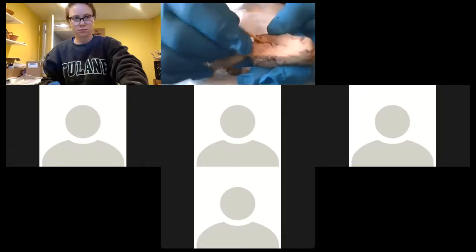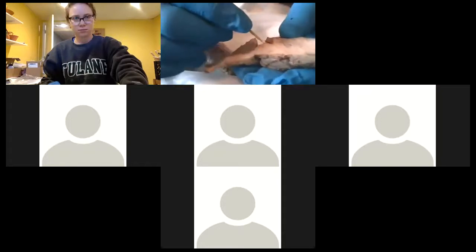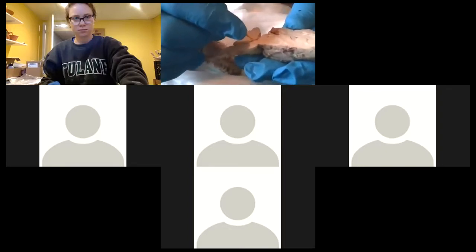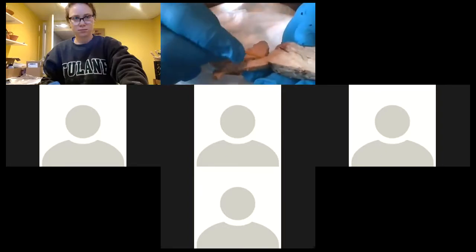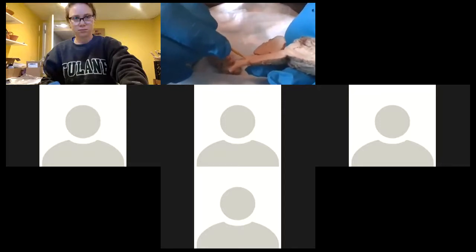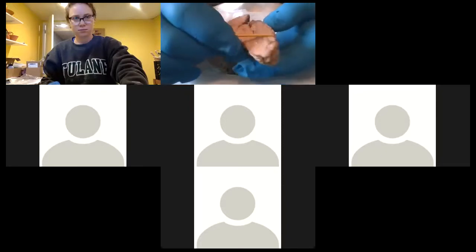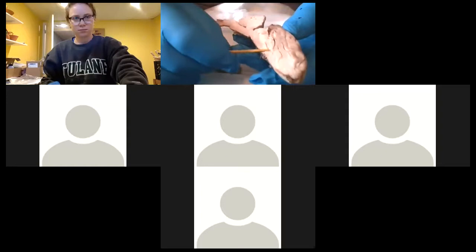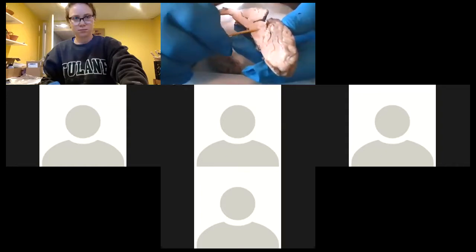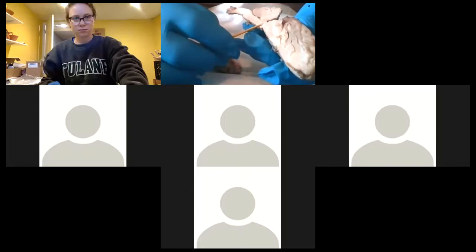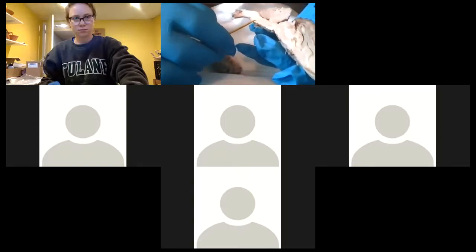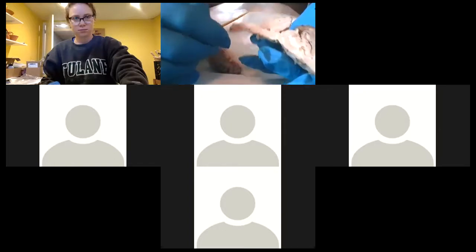So the cerebrospinal fluid starts in the lateral ventricle and then goes down in this area between these two thalamus, or the third ventricle. Then you have the cerebral aqueduct leading to the fourth ventricle. And then starts the central canal, which you really can't see on this brain stem. But you can see down here going into the spinal cord. So the main parts of the brain, just to keep it simple, is all of this up here is cerebrum. All of this in here is diencephalon. Then starts your brain stem, brain stem from midbrain to pons to the medulla oblongata. And then here's your cerebellum.